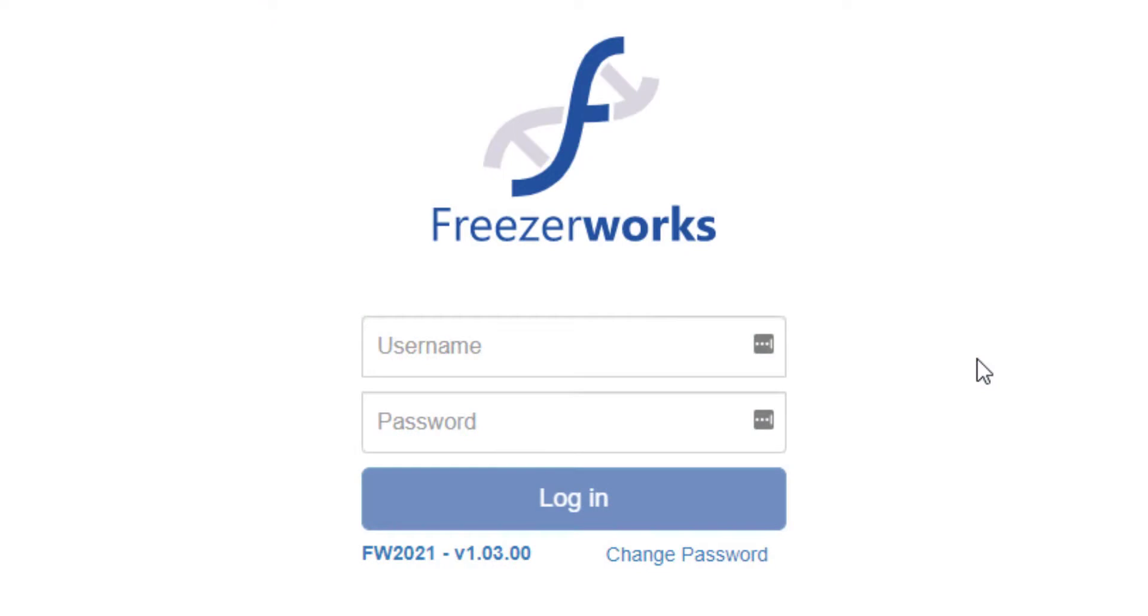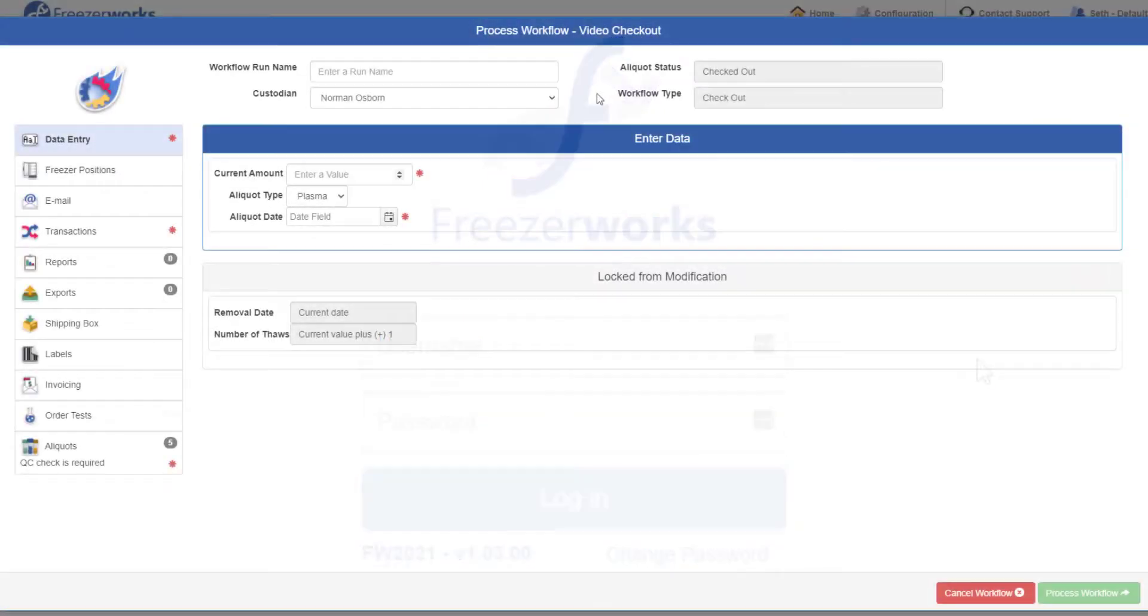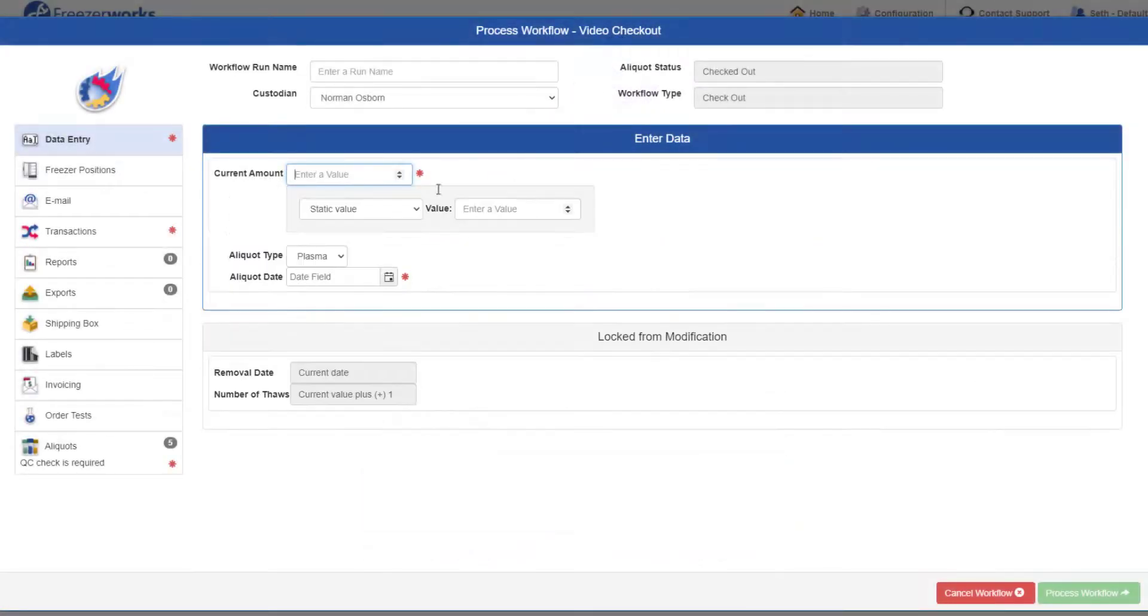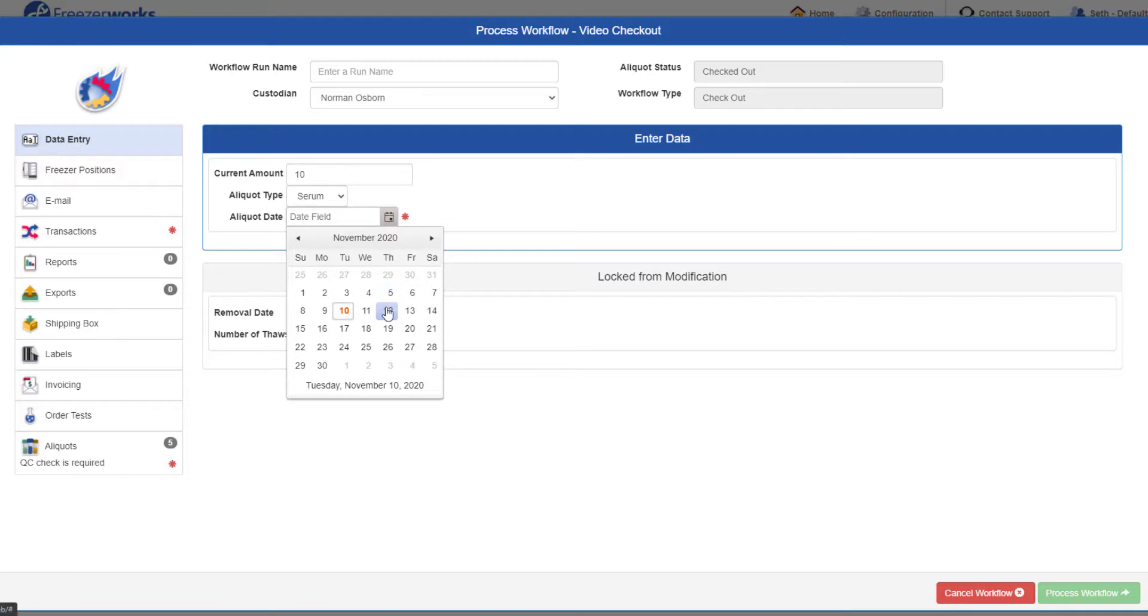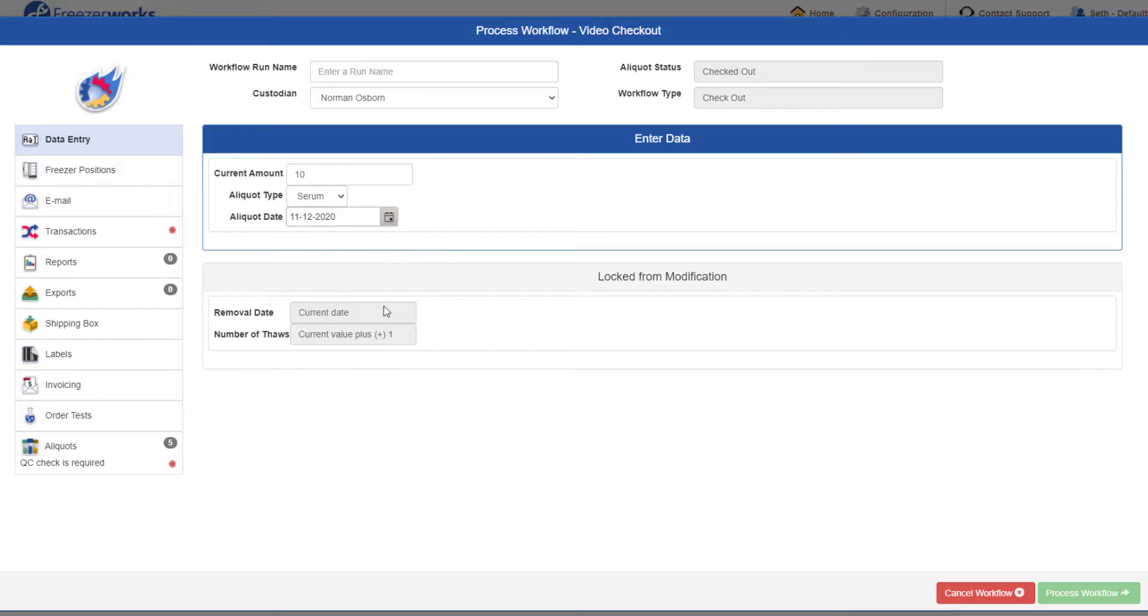Hi there. Welcome to the FreezaWorks 2021 Learning Series, your visual guide to our sample management software. To be honest, it's hard not to get excited about the workflows in FreezaWorks. By standardizing groups of tasks, workflows increase productivity and accuracy while reducing opportunities for user error.